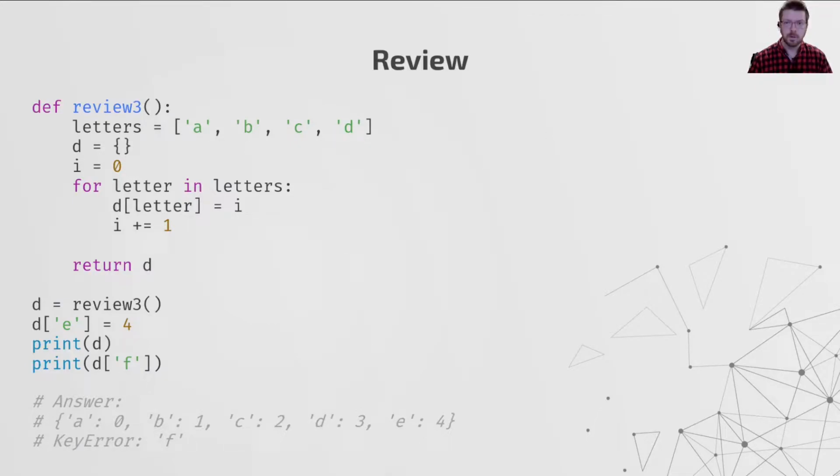If you were unable to predict the output of each of these review functions, you may want to go back and practice the fundamentals a bit more before moving on.